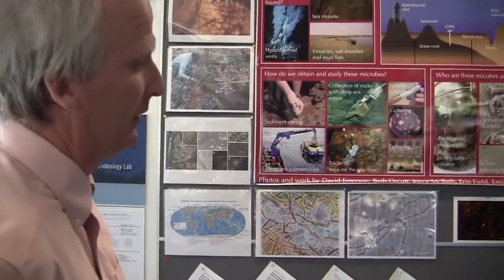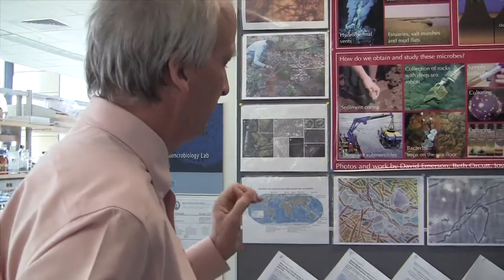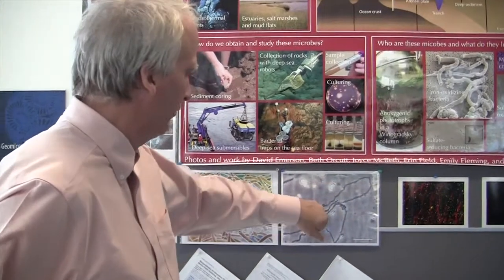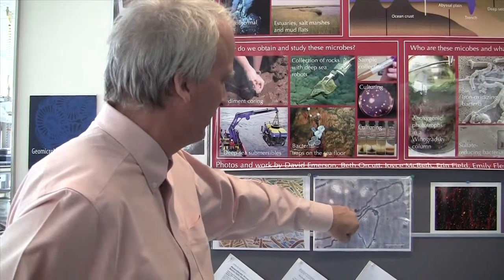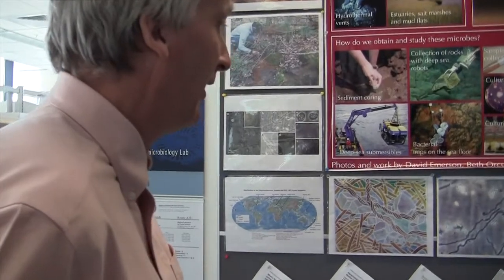And the amazing thing is that all this rust that you see here, that's what they're forming, is rust. It's all biogenic, so it's being formed by the bacteria themselves. And they're pretty cool because they make these mineral structures here. There's a cell right there at the end, but it's spitting out all this stalk material, which is basically an iron oxide with a little bit of organic matter associated with it.